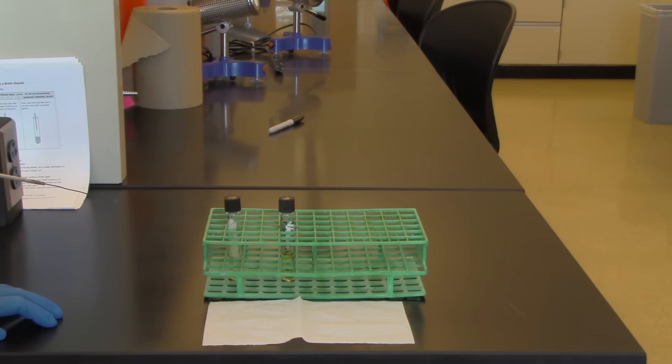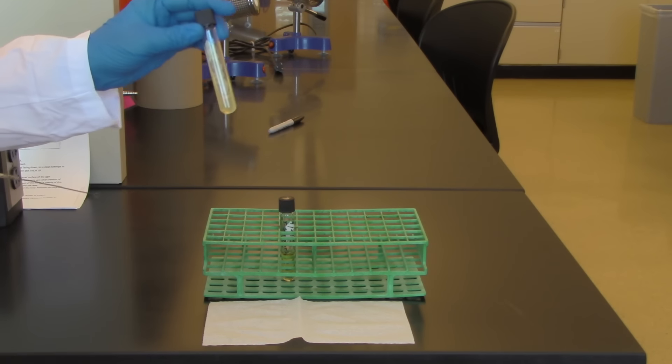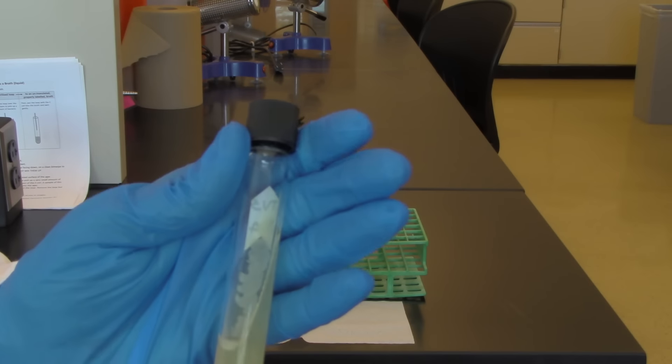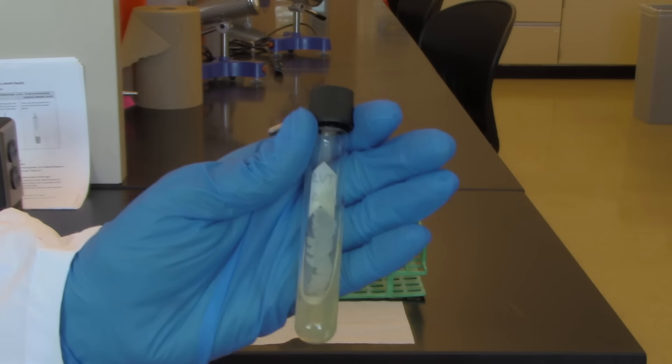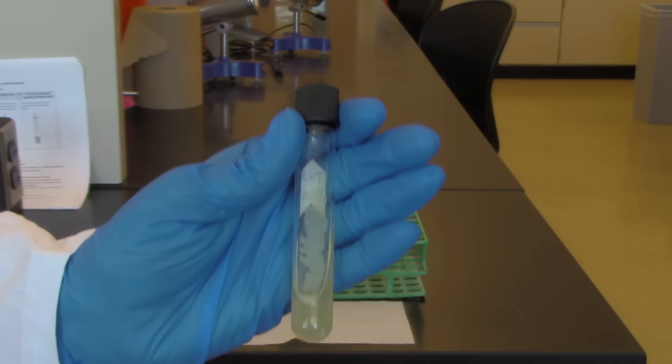This video shows how to inoculate a broth from a slant. I'm starting with a slant with organism already growing on it. If you can see here, you can see a whitish growth occurring on the surface. I want to look for that. This tube already has organism growing on the tube.